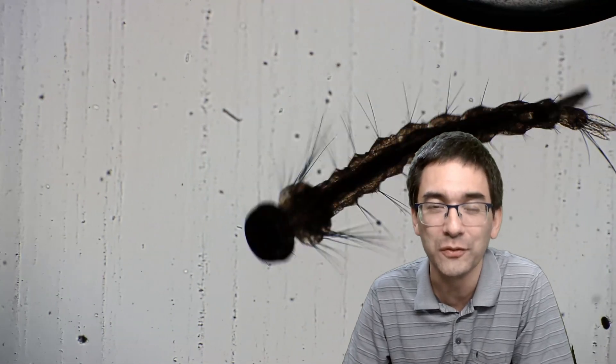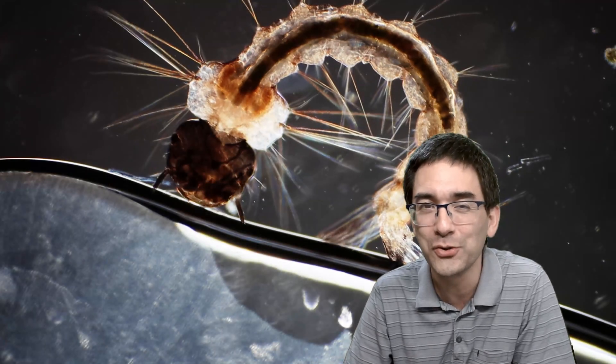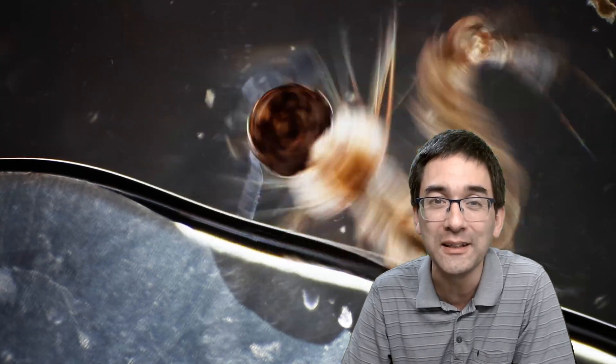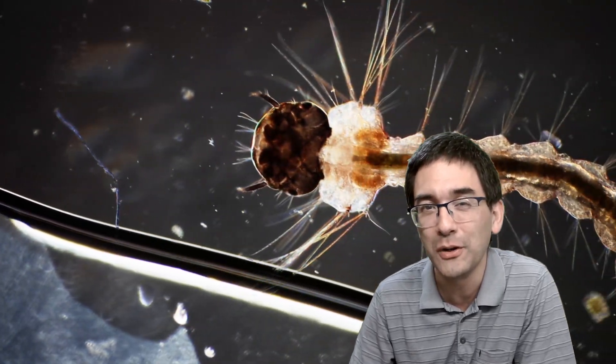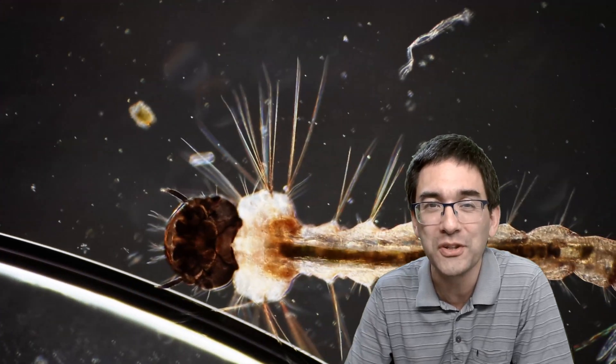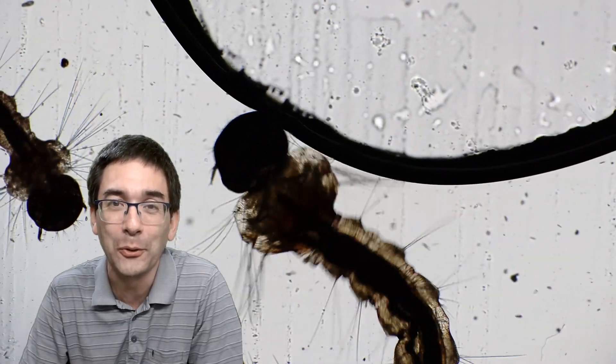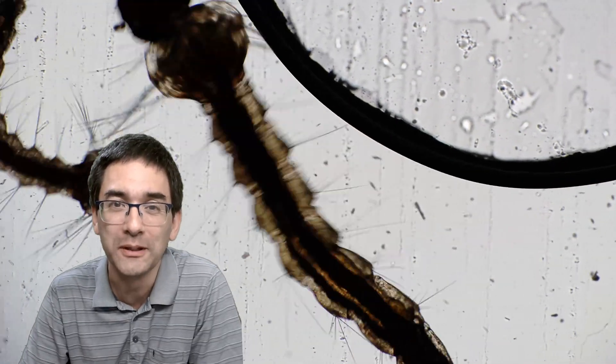So I'm using in most of the cases here the low magnification objective. Of course I also tried out different lighting techniques here. And as always on the bottom you are able to see the air bubble, and this air bubble not only gives the mosquito a little bit of air but also limits its movement a little bit.